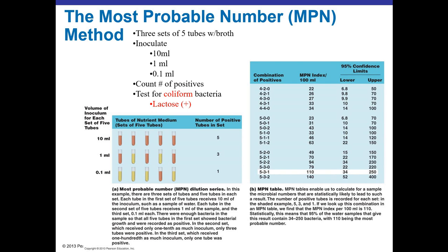They're going to indicate that things may be fecally contaminated. If you have a high coliform number, that would indicate that the waters are fecally contaminated, and the chance or the probability that a pathogen could be present is high, so those waters would be deemed unsafe. It would be really hard to try to find the pathogen. The pathogen is probably in low numbers, and so therefore it'd be like looking for the needle in the haystack. So doing the most probable number based on the normal fecal flora is the best way to be able to get that coliform count to determine whether there's too much fecal contamination.